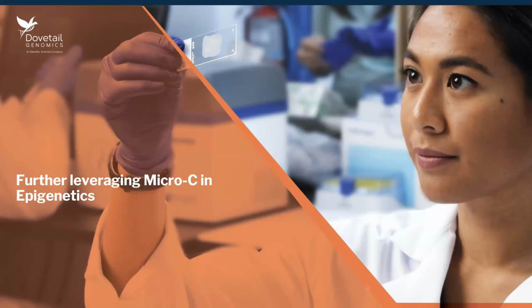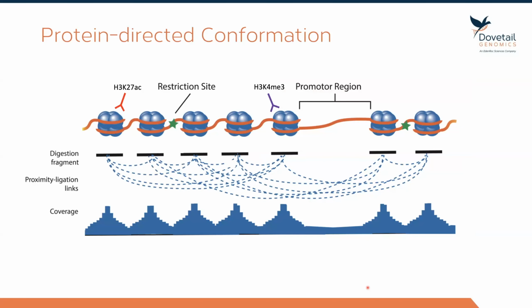And so to end, I'll quickly discuss how to leverage micro-C a bit further in epigenetics. And this is HiChIP, the protein-directed view of chromatin conformation. Here, we showed this image for micro-C and how it's giving us these nice fragments that are the size of a nucleosome and how we can capture all the ligation events per nucleosome. So now if we think about ChIP and really dialing in our chromatin conformation questions to say enhancer regions or promoter regions, right? We bring in chromatin immunoprecipitation, which is very centric to chromatin dynamics and the nucleosome.